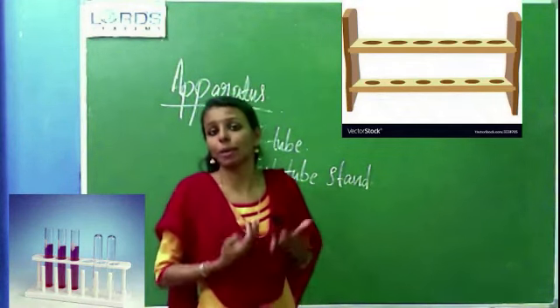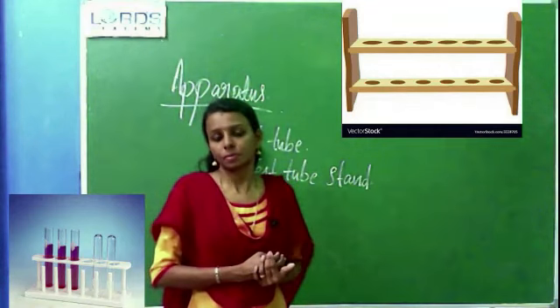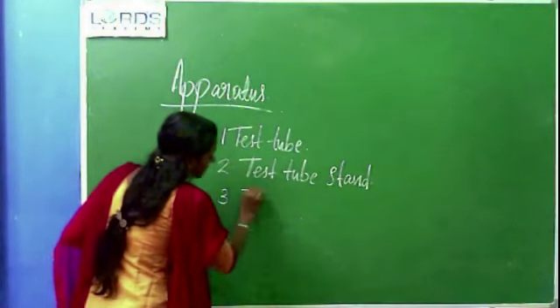It is made up of plastic and wood. Test tube holder.